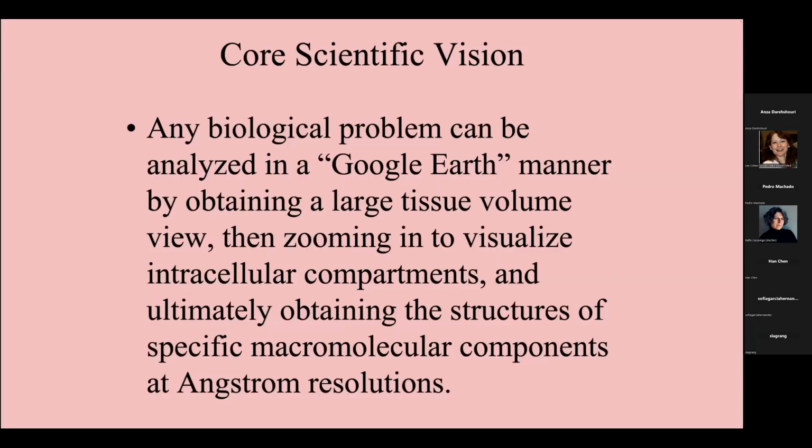My driving goal is to take biological problems and analyze them in a Google Earth manner: obtaining a large tissue view and then zooming in to visualize intracellular compartments, ultimately attaining the structures of specific macromolecular components at angstrom resolutions.